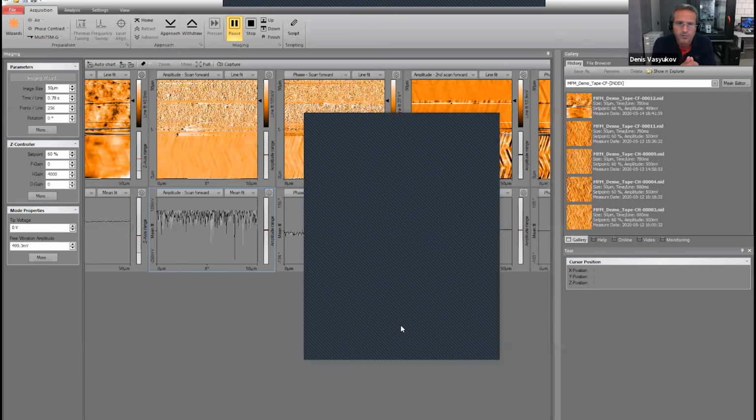For the vertical field, we're still developing a similar holder. We cannot do it integrated because essentially all the part that does the magnetic job is here. So you can get either the vertical magnetic field or the in-plane one. It would have two different accessories. But at least you should magnetize your tip. Samples, most of the time, it is not necessary.